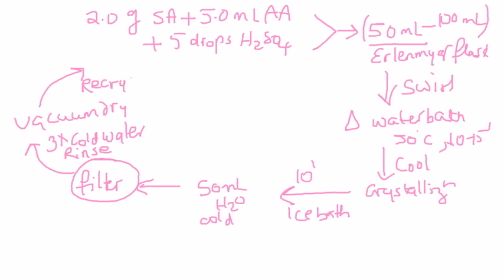You're then going to recrystallize in ethyl acetate, only 2 milliliters. If you see that while you're recrystallizing, it doesn't quite dissolve, just warm it up, okay? Just warm it up, and that should do it. And then you're going to go ahead and do the IR and get the melting point, and that's what you're going to report as your final report.